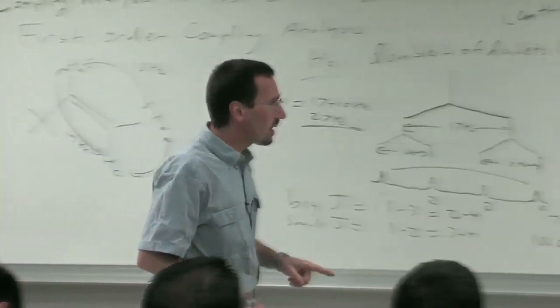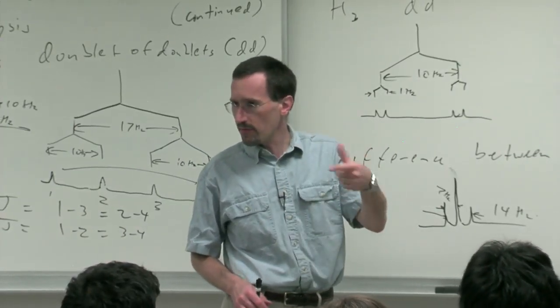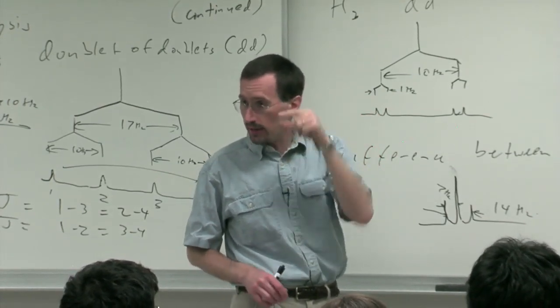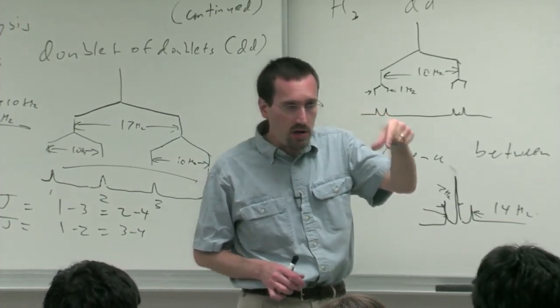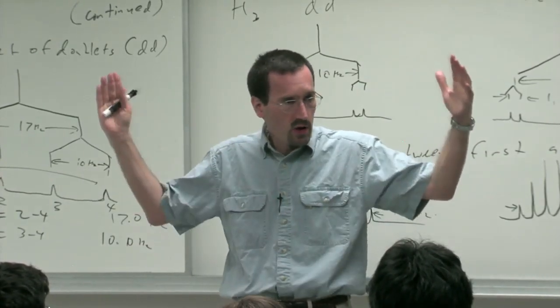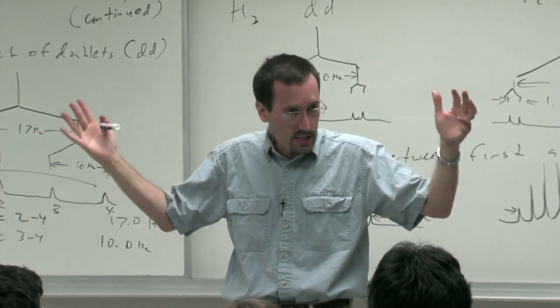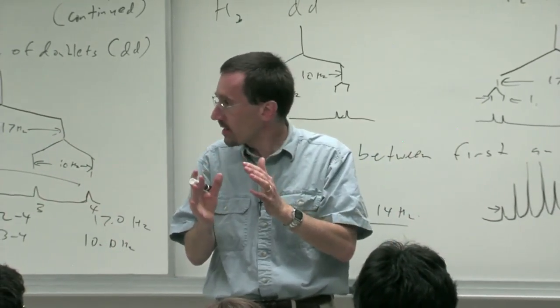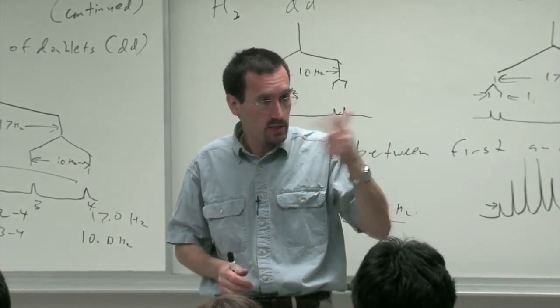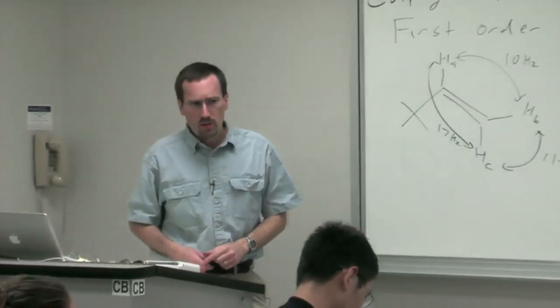And what's also important is, let's say your multiplet is a little bit broad, and this came up with somebody in the Werpel research group who was looking at conformations of cyclic oxycarbenium ions, and couldn't exactly see the size of the multiplet, but he could see whether the multiplet was roughly 7 hertz wide or roughly 15 hertz wide. And that was able to tell him whether his proton was axial or equatorial on a cyclohexane-type ring, on a pyran ring, and hence the stereochemistry and the conformation. So this is why this is extremely important. So thoughts or questions?